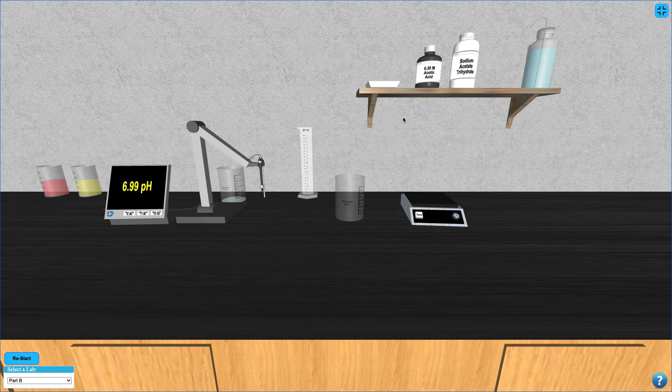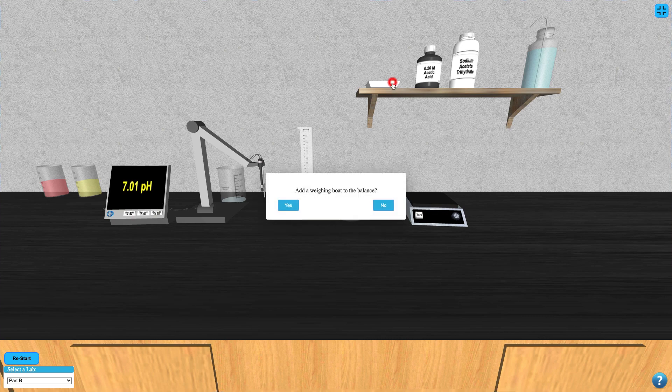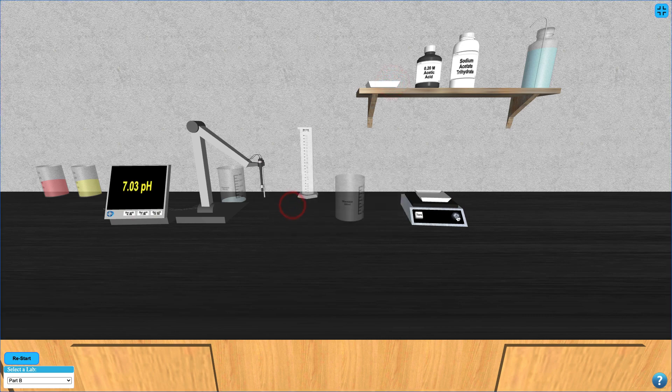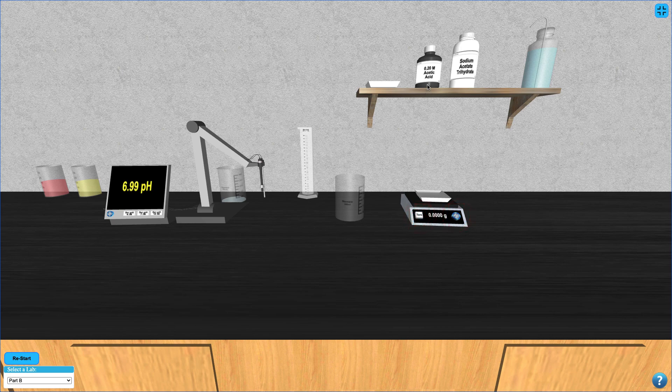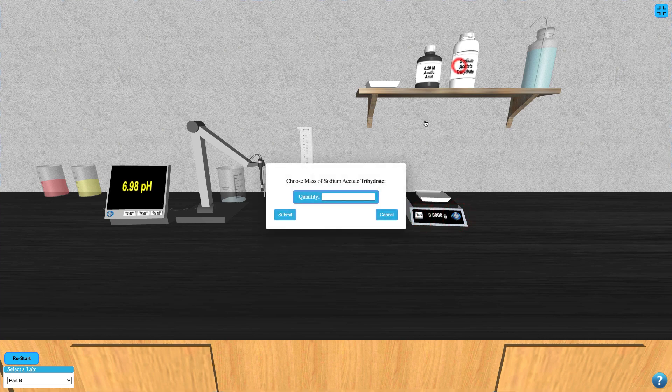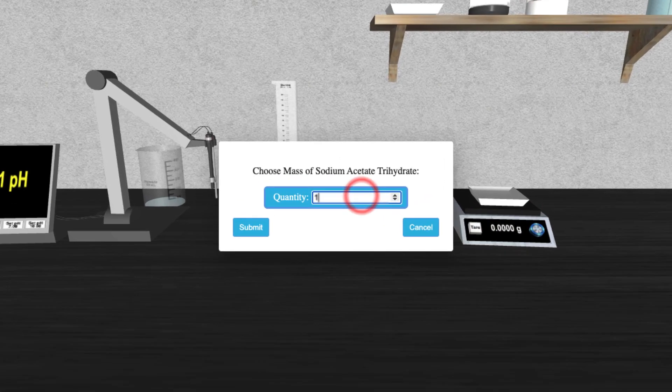Then select a weigh boat from the shelf to measure the desired amount of sodium acetate trihydrate. This amount will come from your own calculations.